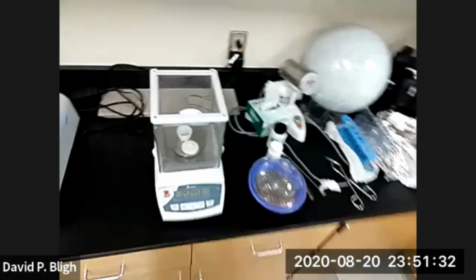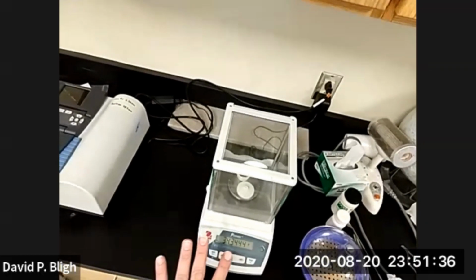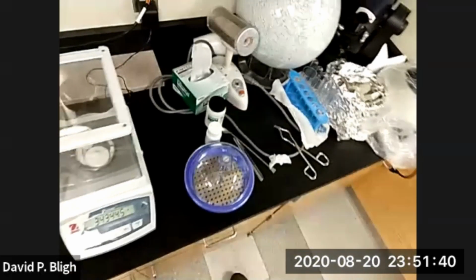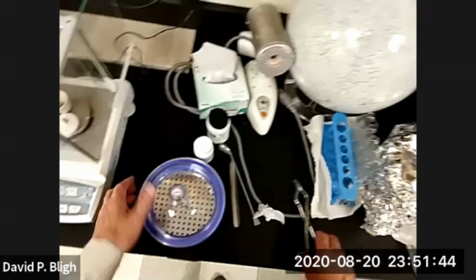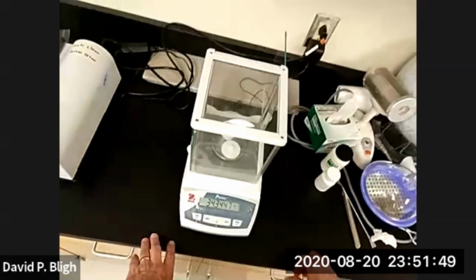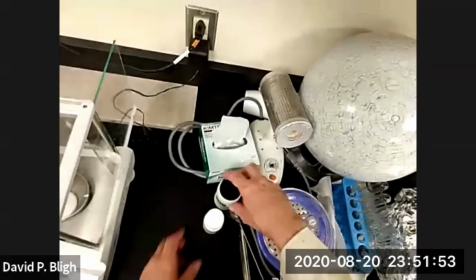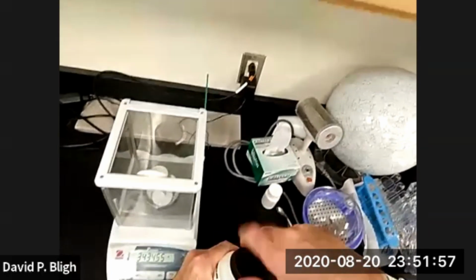And the accuracy, remember, here is 4 decimal places, which is 0.0001 grams. So let me get this out of the way. And let's see, what's 2.5 grams plus that is 36.8. So our target is 36.8 for this substance.